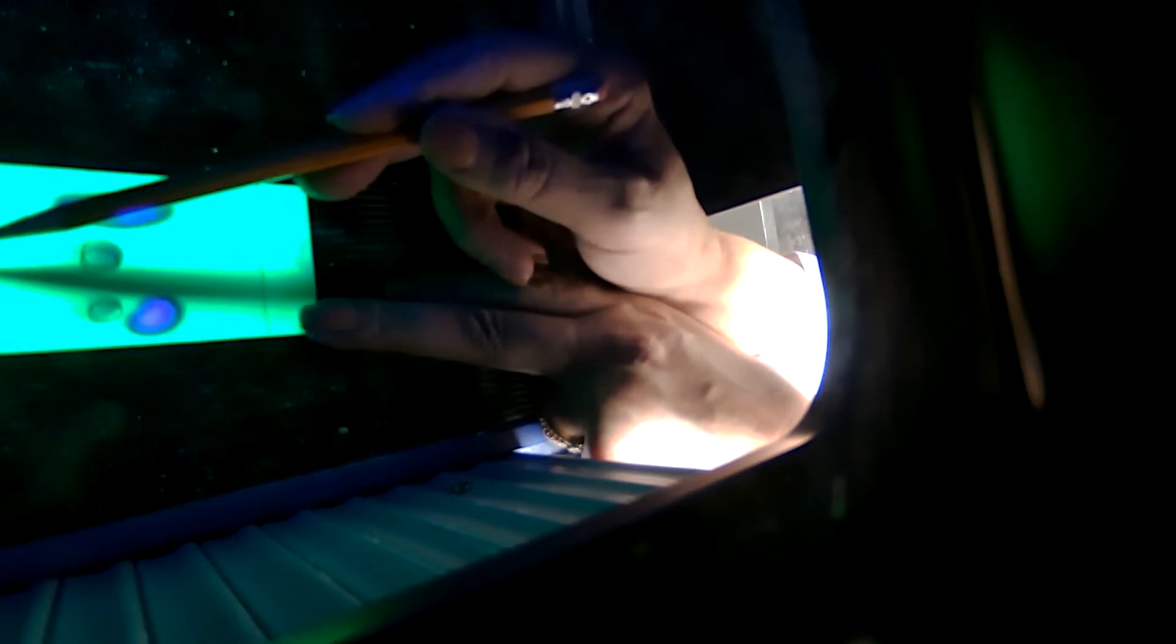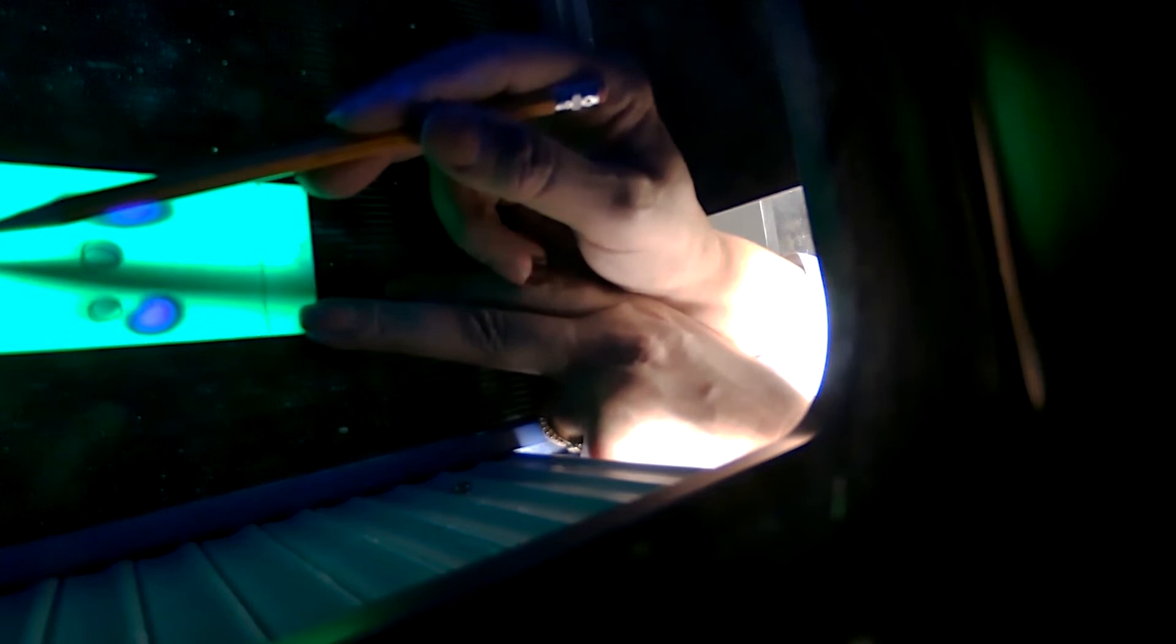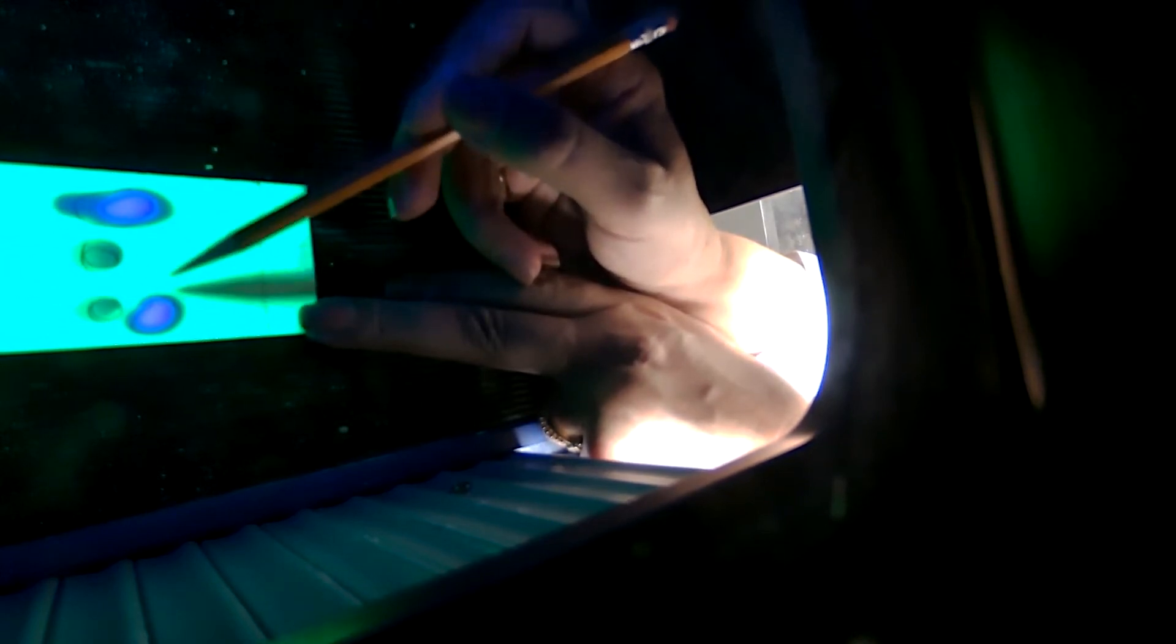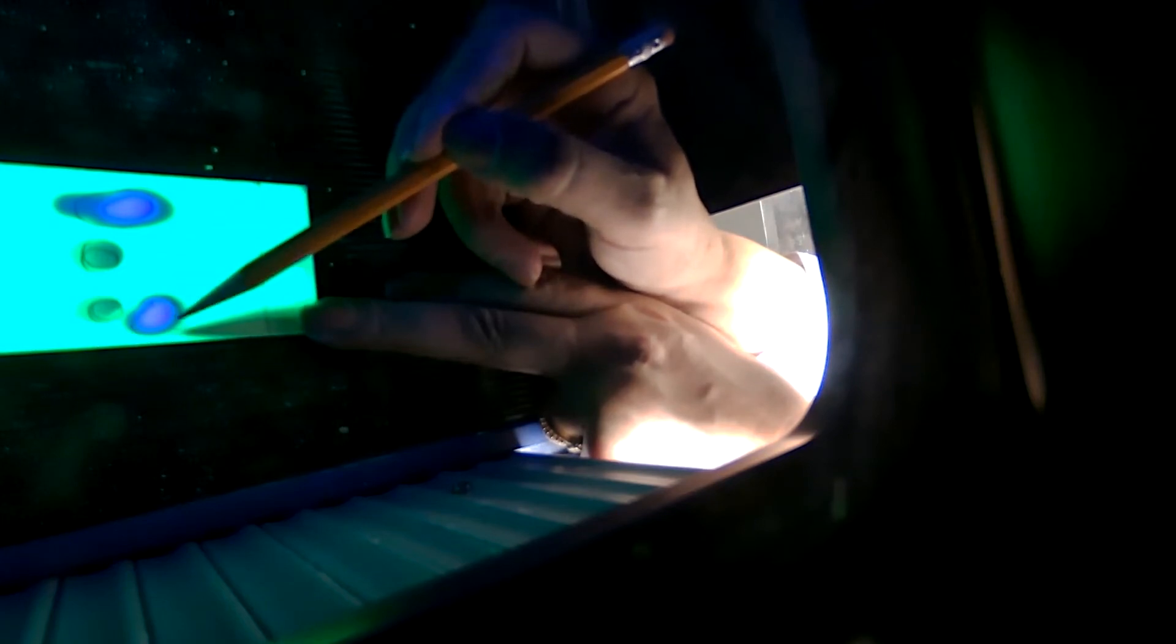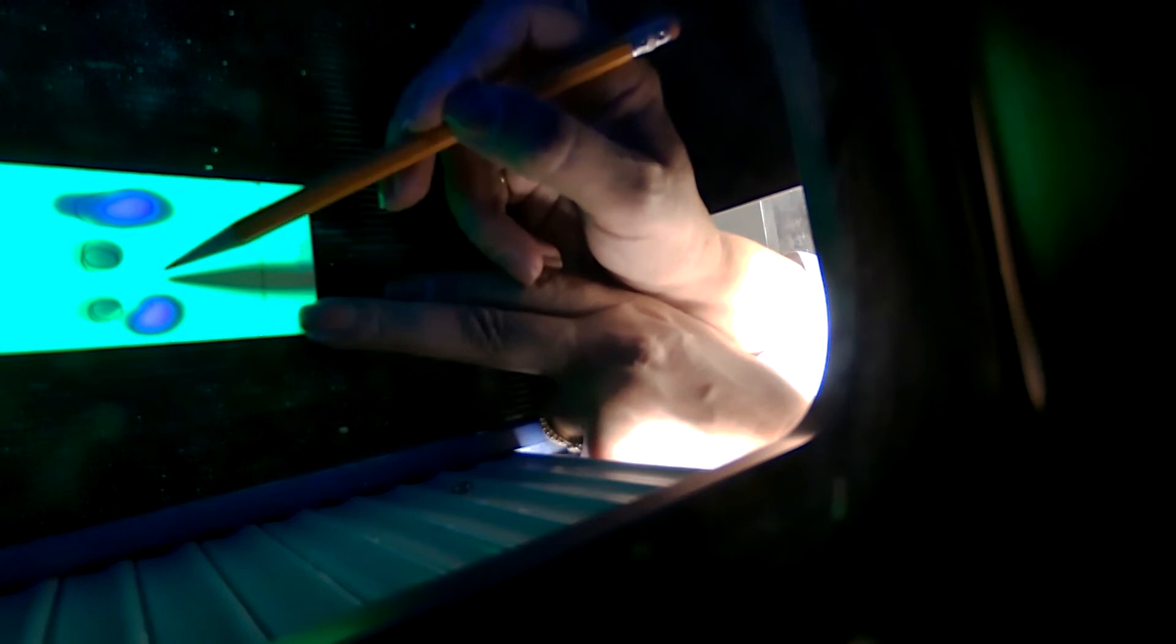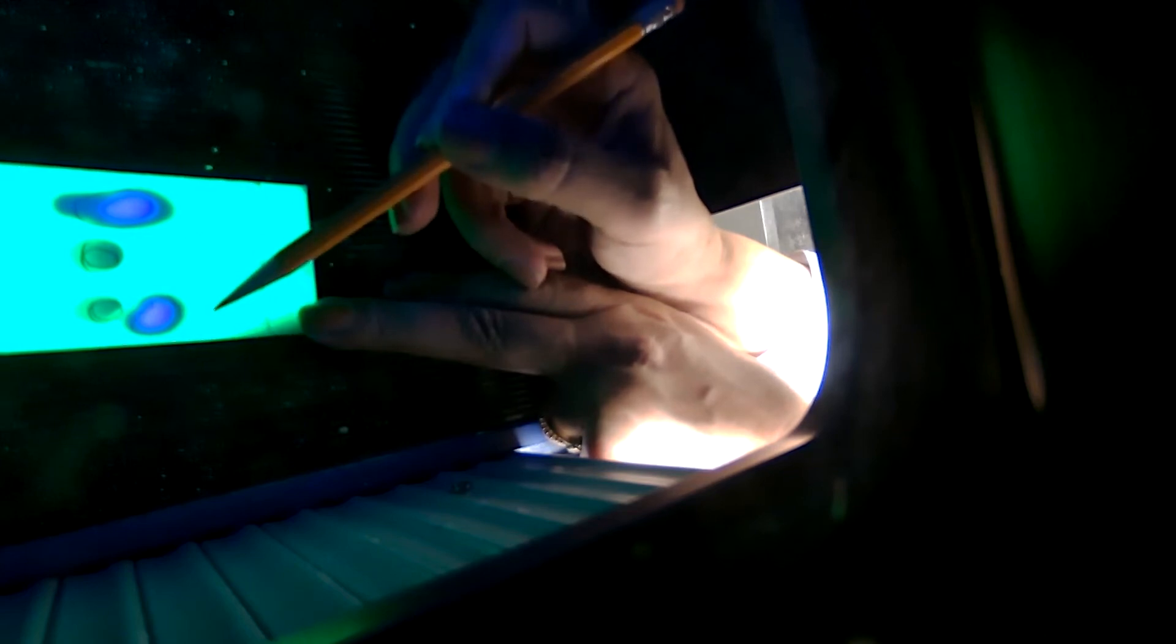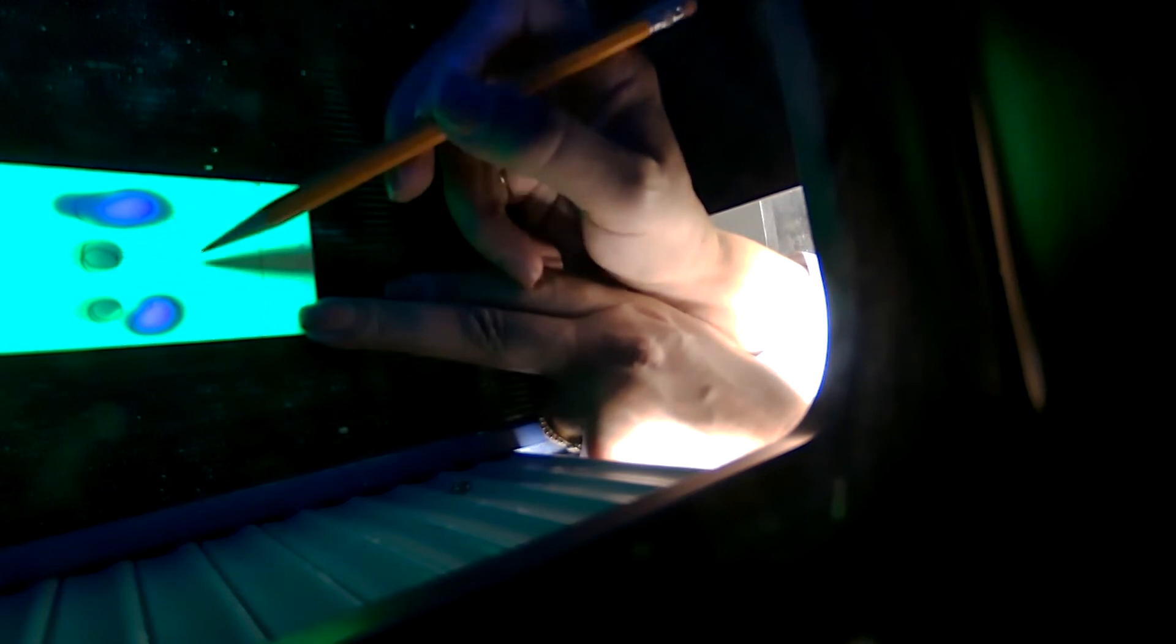So let's say if our acid compounds had some of the neutral organic neutral compounds as impurity, you would have something here as another spot with this like a navy blue color right here. You would see that, I don't know if I call it navy blue color, it's just the blue color spot here for the neutral compound, but it doesn't show there.